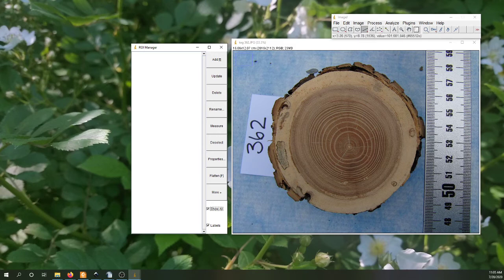So let's get started. We've got a measurement, and you can click on Add, or you can use Command or Control T. So you notice that I had Show All a minute ago, and so you'll be able to see all of your measurements. If you just do measurements by themselves, you're not able to see all of those at once. So I can use the keyboard shortcut. We can do a couple other measurements.